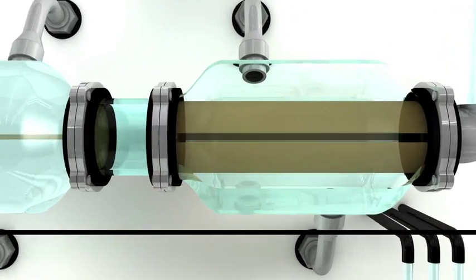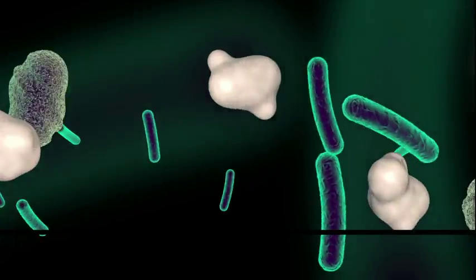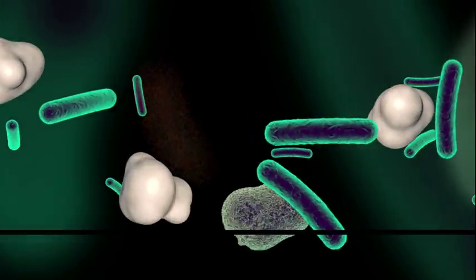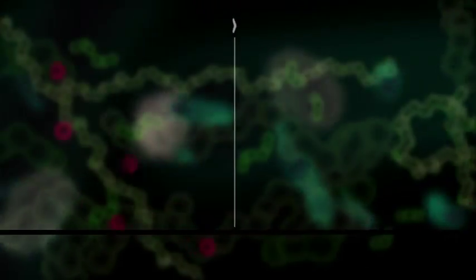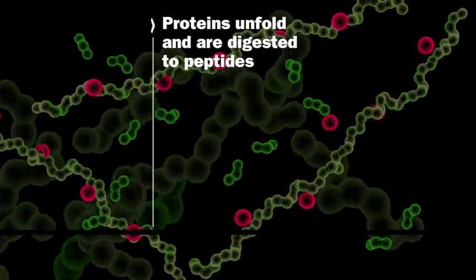When we zoom in, we can see what happens to our meal. Most bacteria from our yogurt will disintegrate and not survive the stomach due to its acidity. A large part of the proteins is unfolded and broken down into smaller peptides by the pepsin.